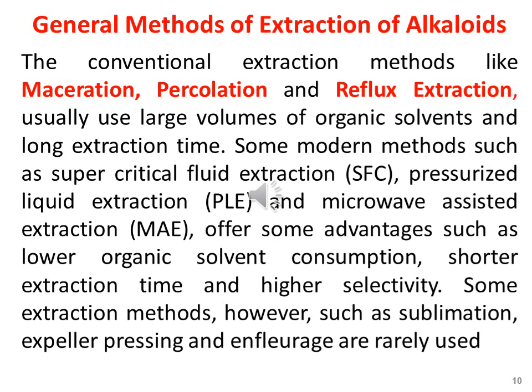Solvents with a polarity value near to the polarity of the solute are likely to perform better and vice versa. The greater the solvent to solid ratio is, the higher the extraction yield is. However, a solvent to solid ratio that is too high will cause excessive extraction solvent and require a long time for concentration. The conventional extraction methods, including maceration, percolation, and reflux extraction, usually use organic solvents and require a large volume of solvents and long extraction time.